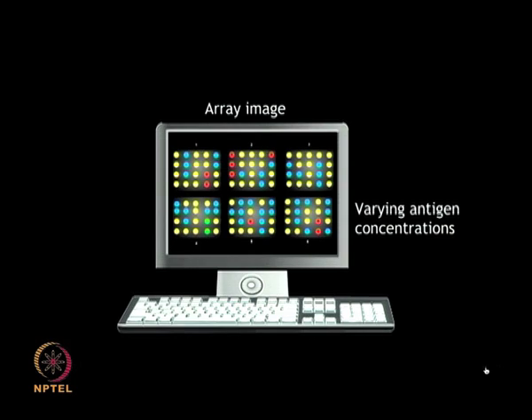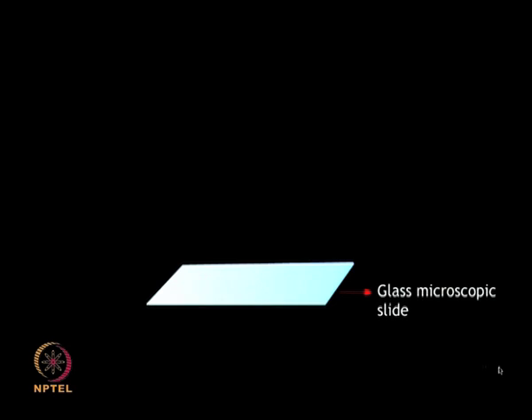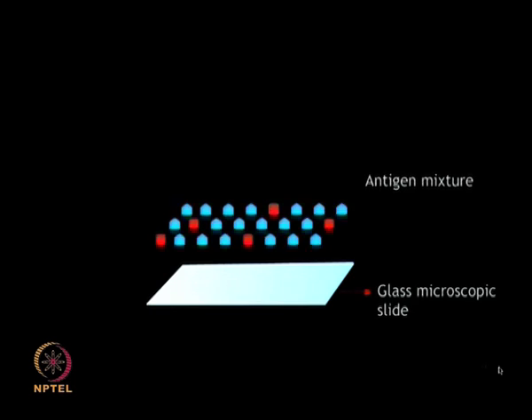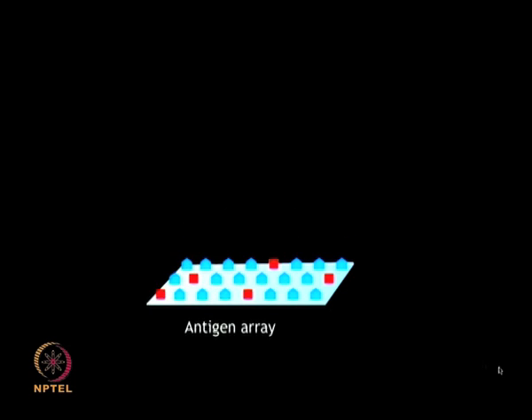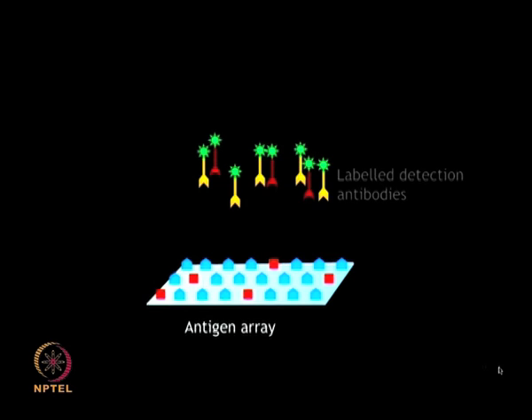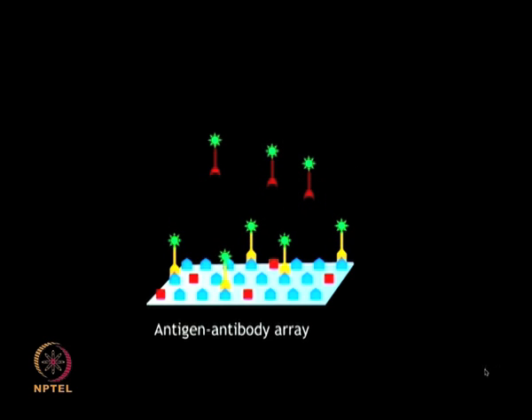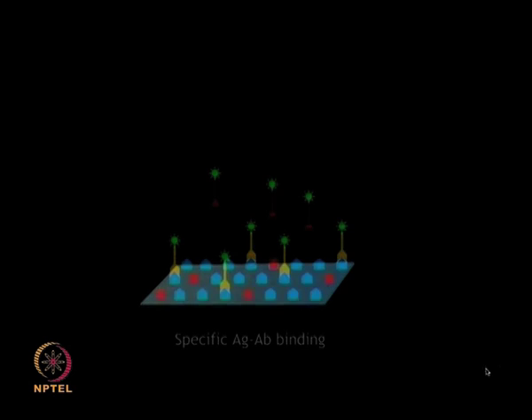The authors found that such microarrays of antibodies could detect their corresponding antigens at concentrations as low as 1 nanogram per ml. In a complementary experiment, the authors generated 6 antigen arrays having 116 different antigens, which they probed with the Cy3 or Cy5 labeled antibodies of varying concentrations.